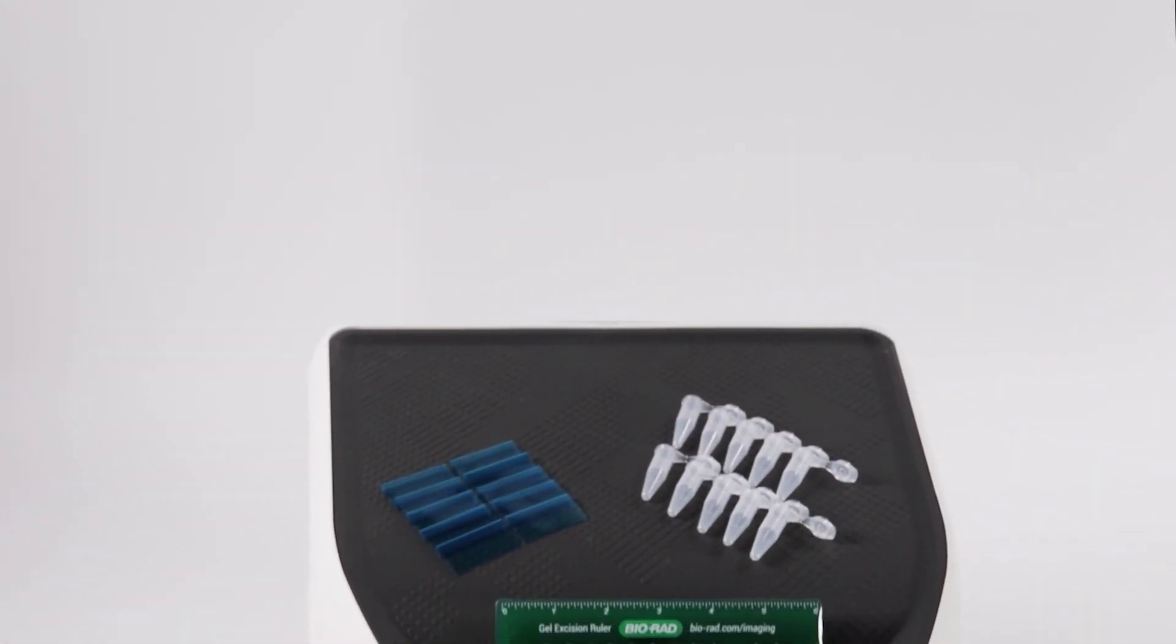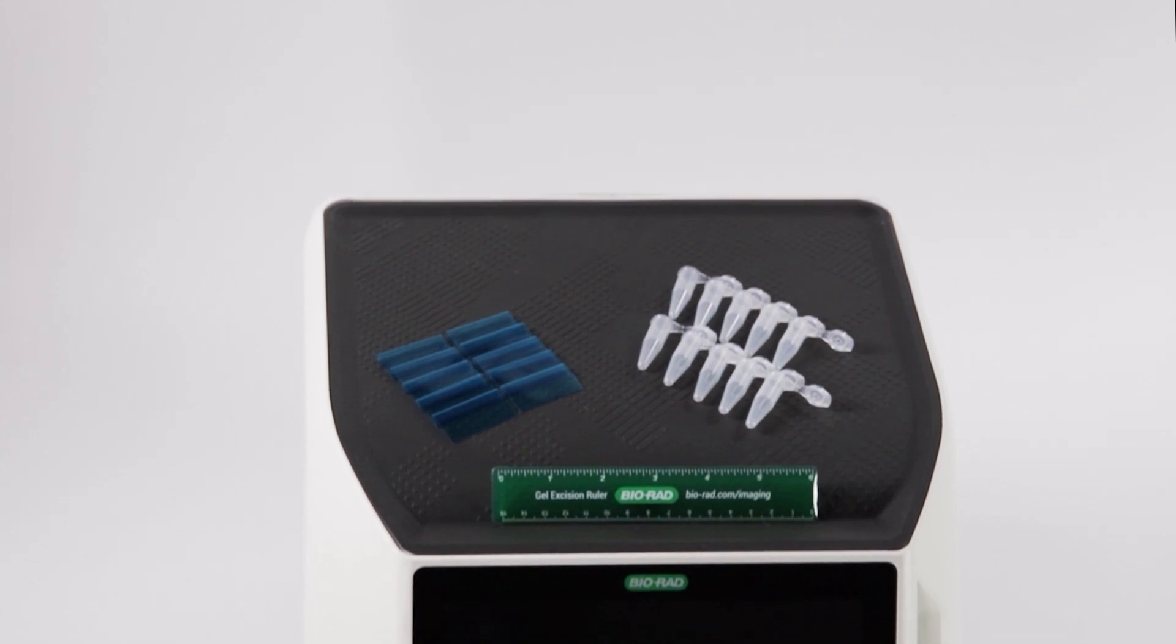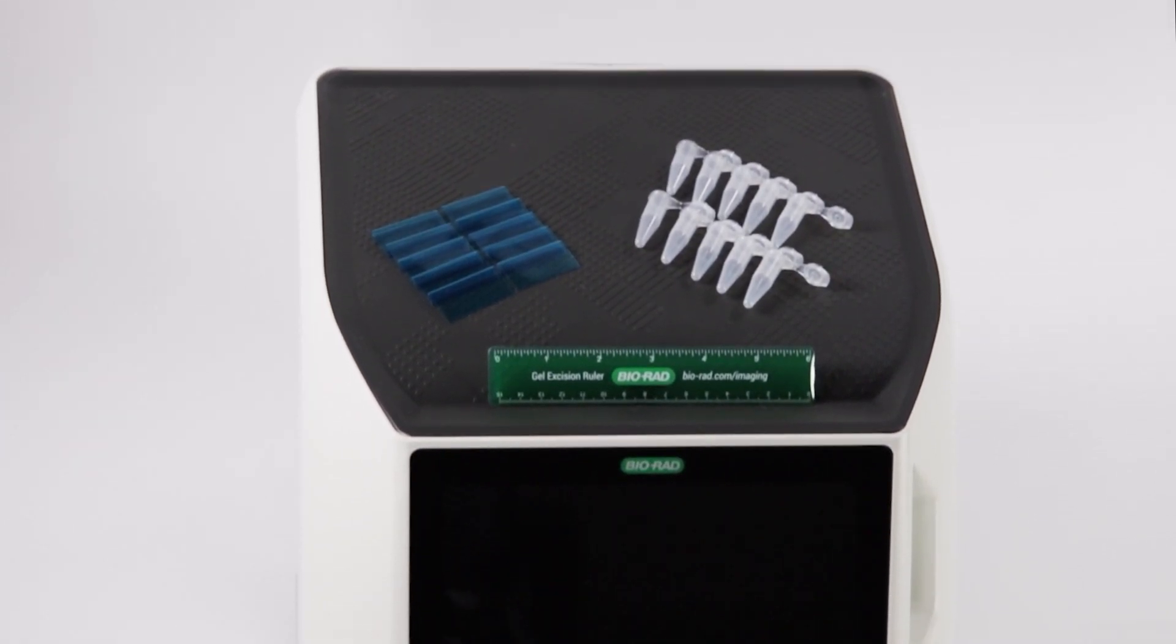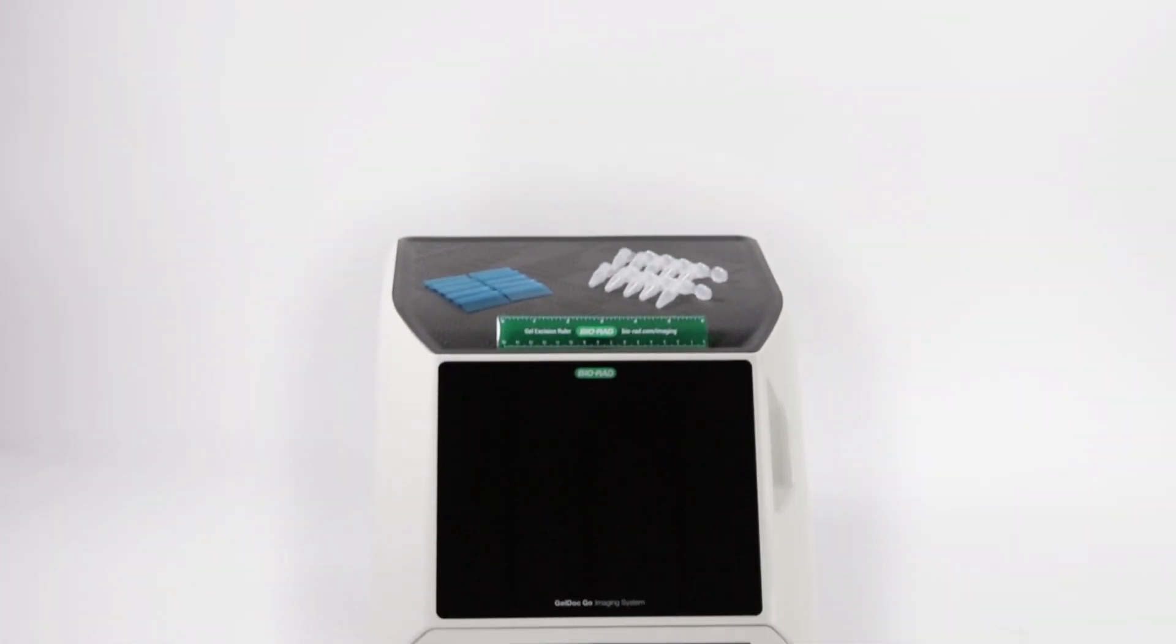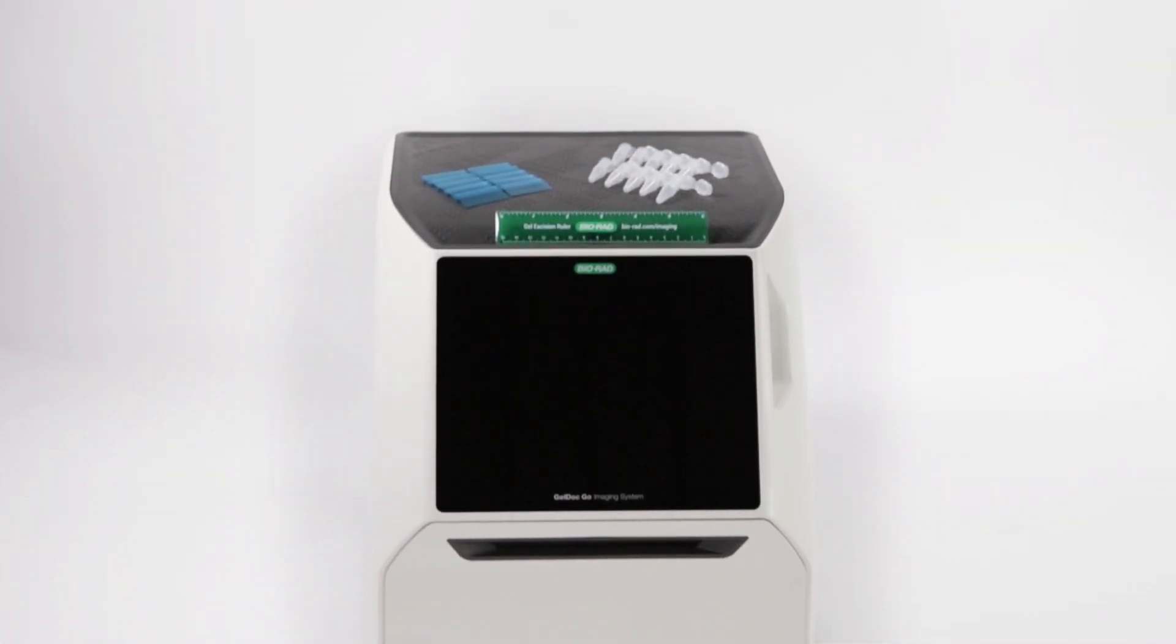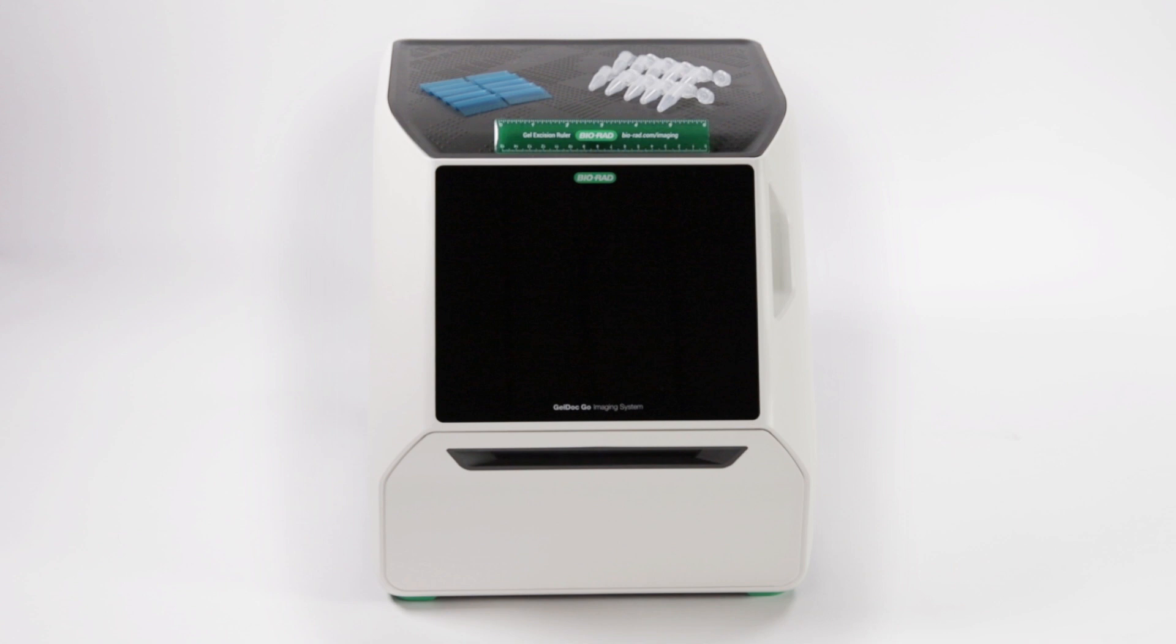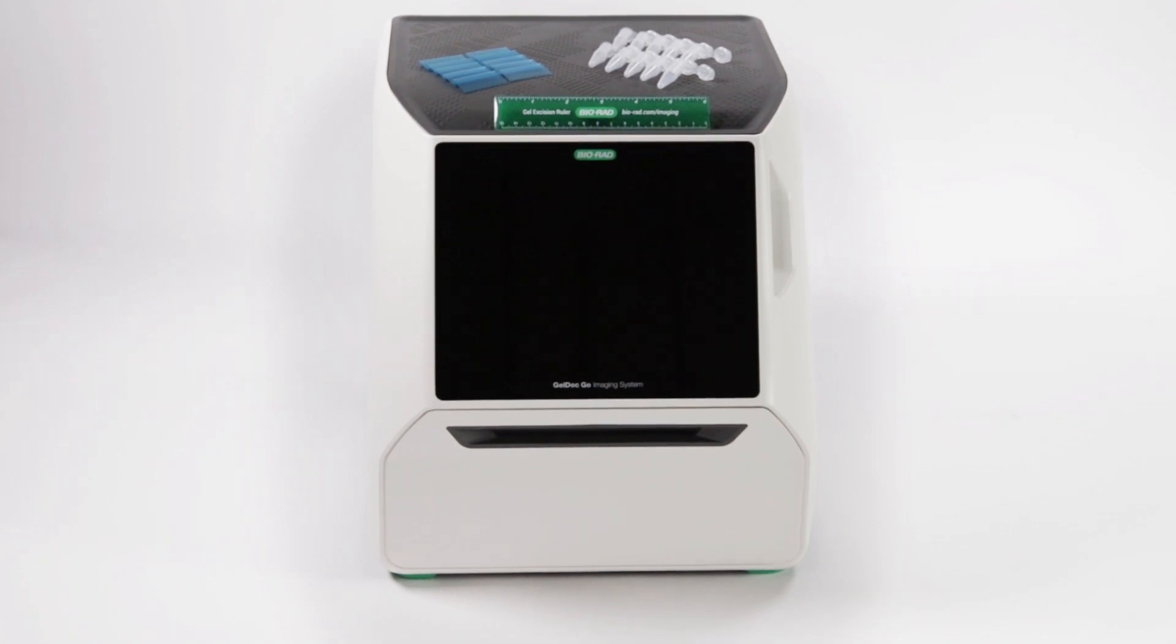The Bio-Rad Gel Excision Kit comes with everything you need to safely excise agarose gel bands directly on the Gel.Go imaging system or other gel imagers.